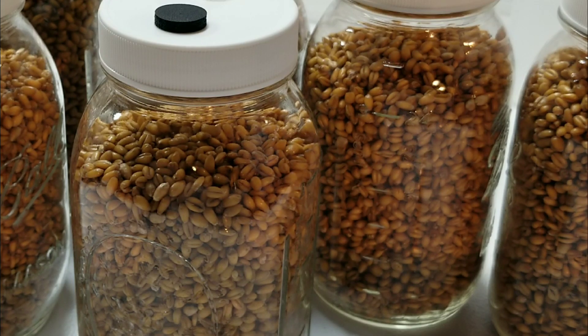Moisture balance is very important in all things mushroom growing and grain spawn hydration is no exception. I'm using wheat grain but this technique can be used for pretty much any grain. Some grains are a little harder to hydrate than others - sorghum is a little more difficult, popcorn you may have to extend your soak times or start with hotter water. I prefer a soak method and do not like to cook my grain because the cooking process leads to burst kernels, which greatly increase the risk of bacterial contamination.